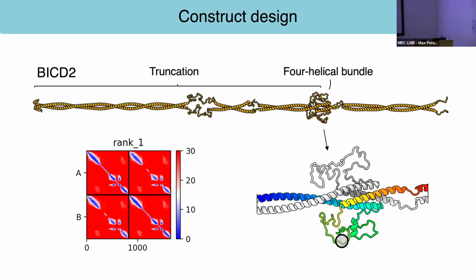But if you run the AlphaFold prediction, you can see here I've colored just from N to C that it kind of wraps around and forms this whole four-helical bundle. And so when I truncated it, essentially I broke this interaction and probably exposed something that made this protein unhappy. So this was insoluble. After seeing this prediction, I made a truncation that was further down, and now this protein purified quite well. So this is, I think, an easy way that AlphaFold helps with just biochemistry pipelines.